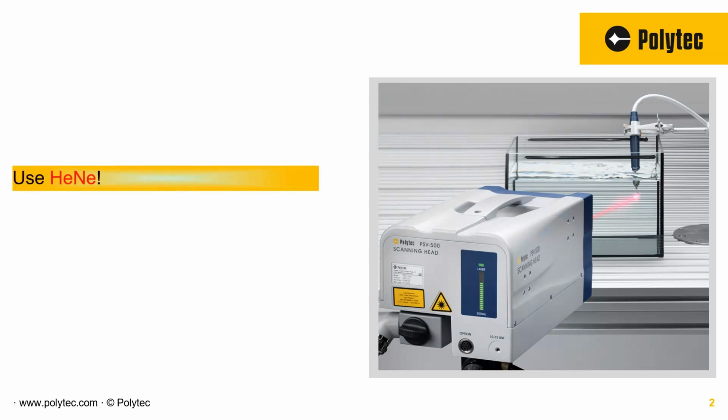So number one, you want to use the helium neon laser source, not the Q-Tech, because the Q-Tech uses the infrared laser, which gets absorbed at the water surface. So if you're going through a surface, HeNe is the choice. HeNe is the one you want to use.